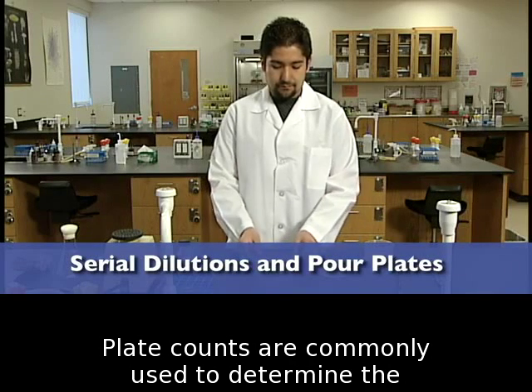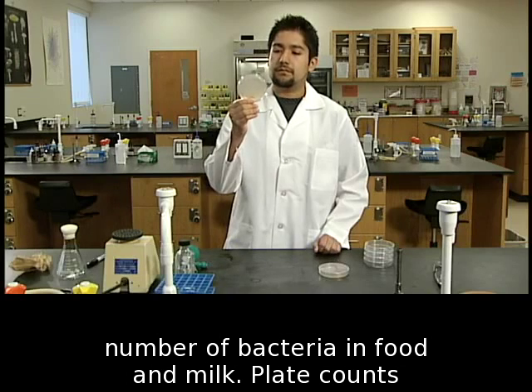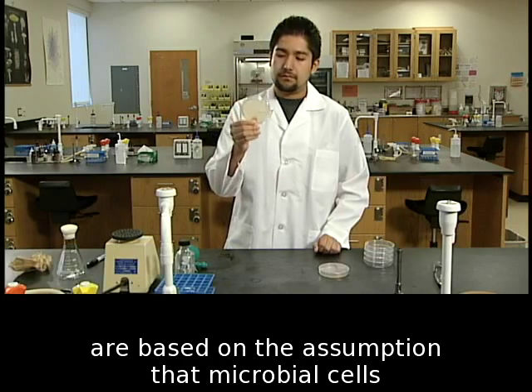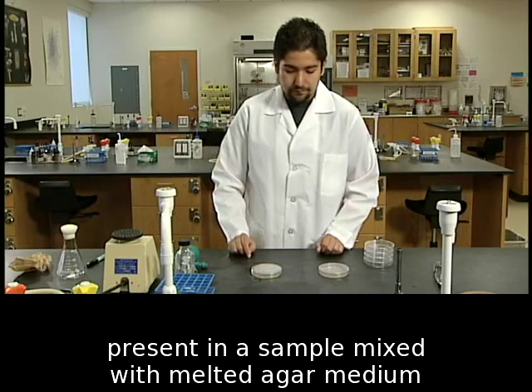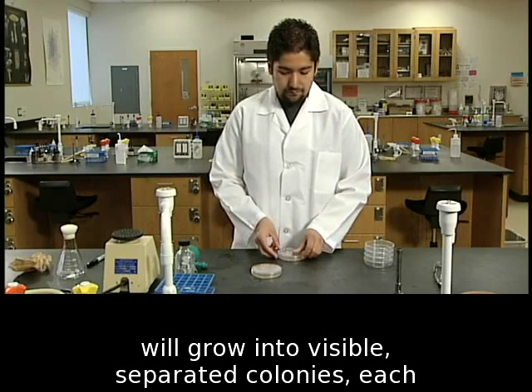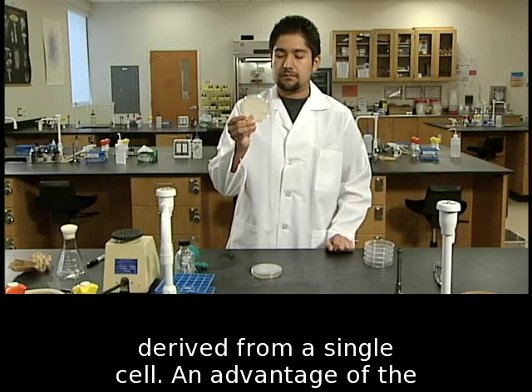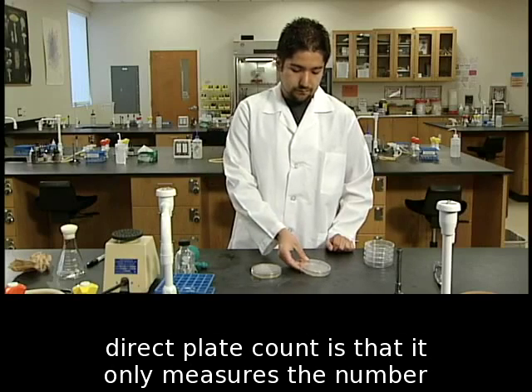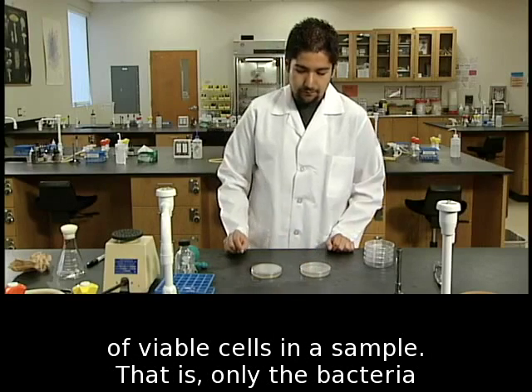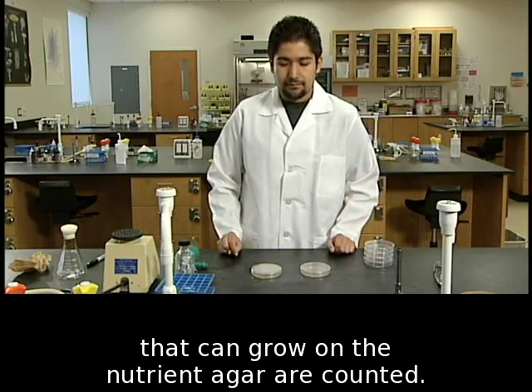Plate counts are commonly used to determine the number of bacteria in food and milk. Plate counts are based on the assumption that microbial cells present in a sample mixed with melted agar medium will grow into visible, separated colonies, each derived from a single cell. An advantage of the direct plate count is that it only measures the number of viable cells in a sample. That is, only the bacteria that can grow on the nutrient agar are counted.